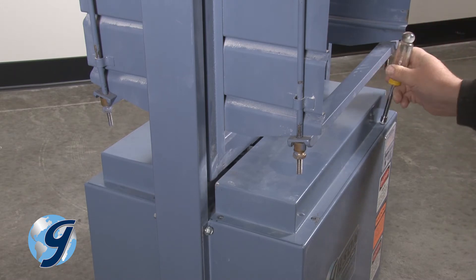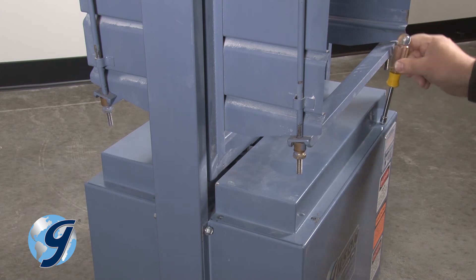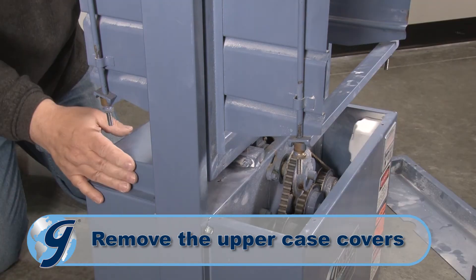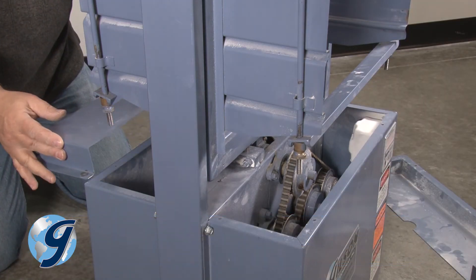To remove the case covers, start with the upper case covers by loosening the eight screws. Then set the upper case covers and screws aside.